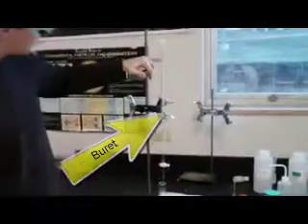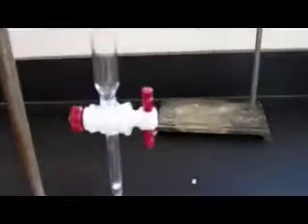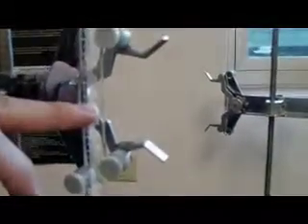You'll notice that it goes from 0 at the top down to 50 at the bottom. So when you use this, you're always going to start with your solution up here at 0, and you're going to dispense it, and then when you're done dispensing, you turn it off, and whatever the volume is, you just read it. You don't have to subtract it from 50 or anything like that. Just whatever the number is, that's how much you've dispensed.